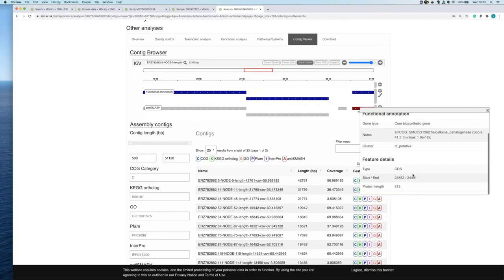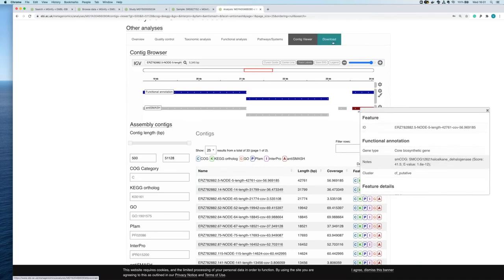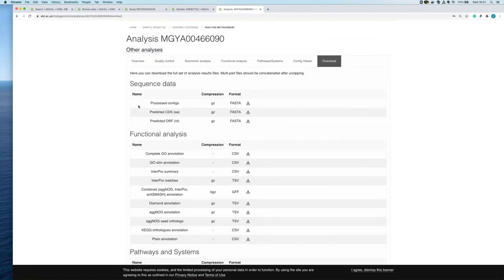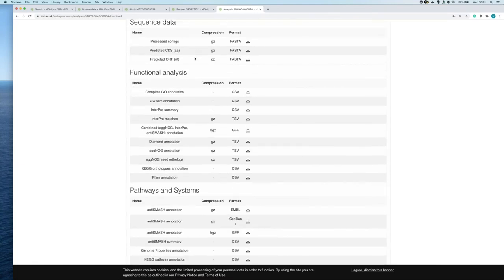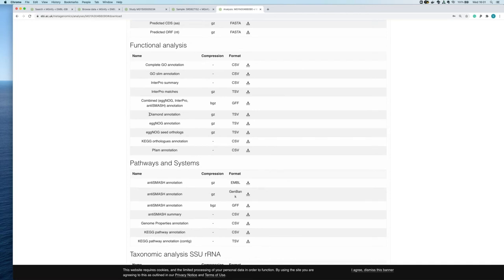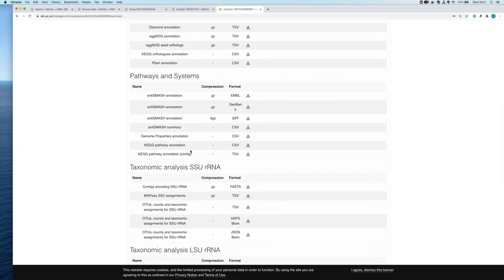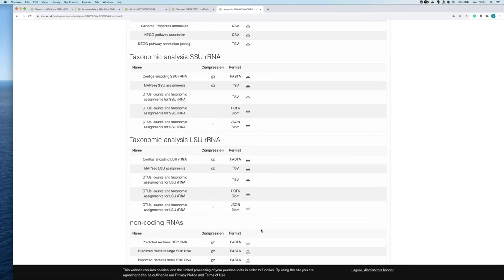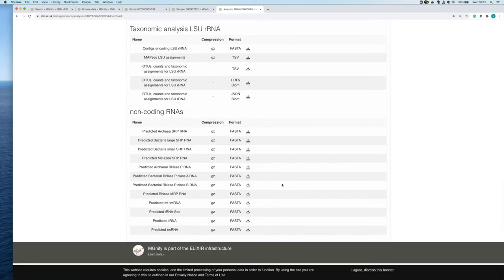If you click on a particular feature it will tell you it's a predicted coding sequence along with all the functional annotations. Finally, the download page contains everything discussed: processed contigs, predicted coding sequences in both amino acid and nucleotide format, all functional annotations including DIAMOND taxonomy and antiSMASH pathway annotations, taxonomic annotations in several formats, and any non-coding RNA found with the models we're using.